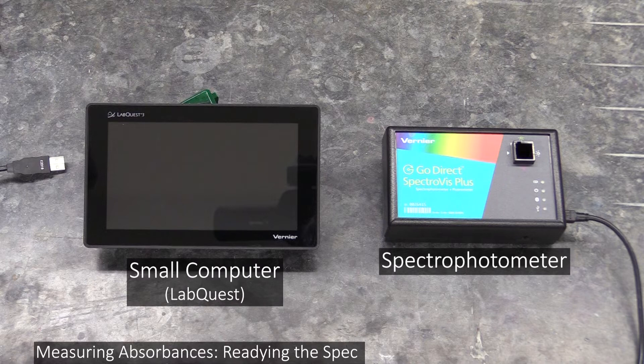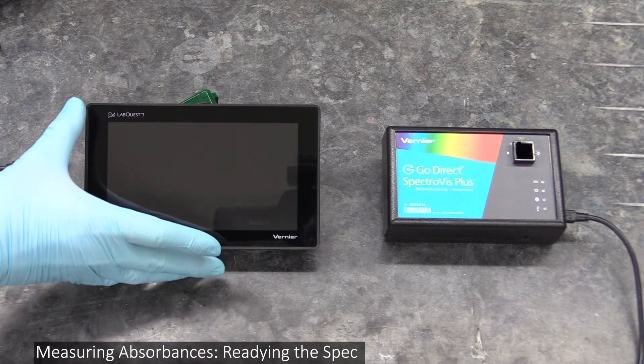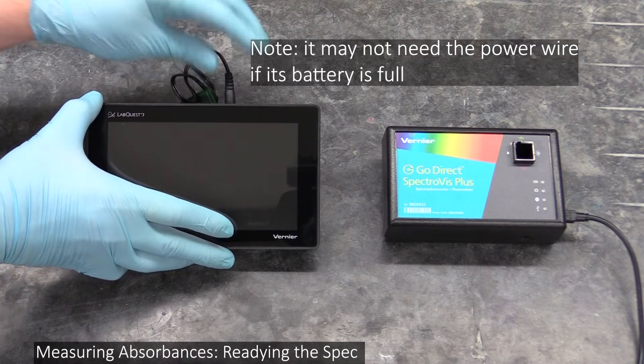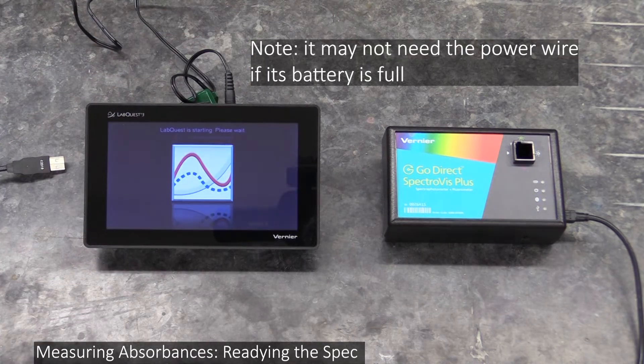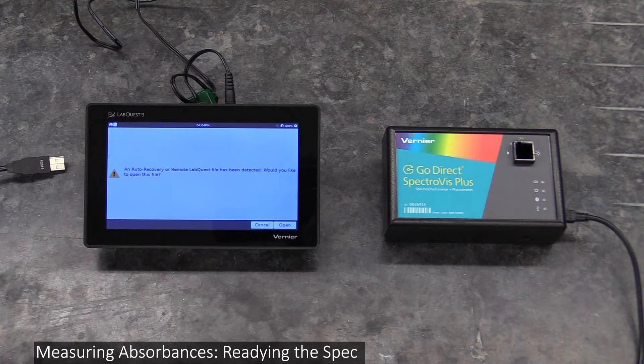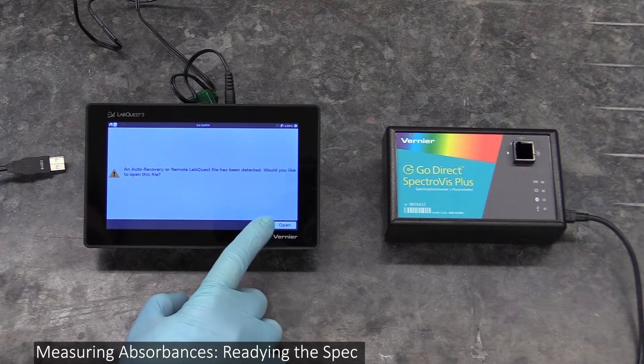Before you can use your spectrophotometer to measure anything, you have to calibrate it. Start by plugging the computer's power wire in and turning it on. If it asks you about an auto recovery file after it boots up, just press cancel.